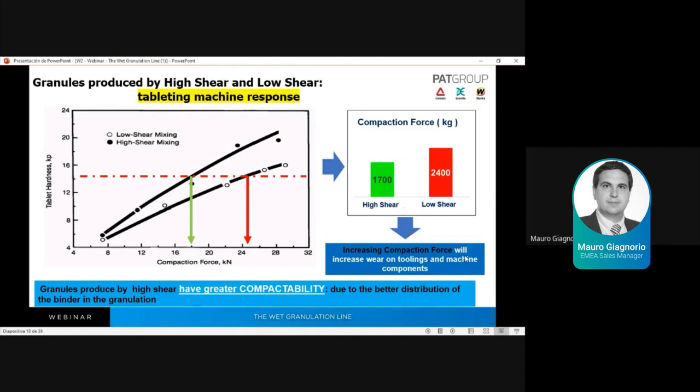Arturo, we have one more question. Yes. It says the following: what methods can we use to compare physical properties, mechanical strengths of granules, like friability, hardness? It's a common case when granules obtained by different wet granulations have various mechanical properties. They could be more or less hard, for example. This is a question made by Helena.